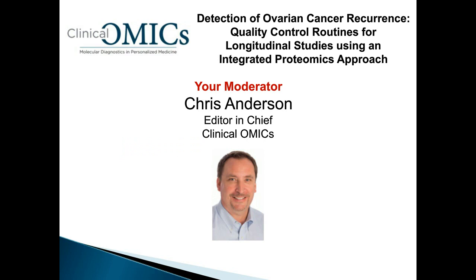Ovarian cancer is the leading cause of death from gynecological cancer in North America, and the fifth most common cancer among women. In the United States alone, more than 22,000 women will receive a new diagnosis of ovarian cancer, and it will result in approximately 14,000 deaths this year. Today's presentation will detail recent research using a shotgun proteomics approach using mass spec to identify peptide biomarkers indicative of ovarian cancer recurrence.